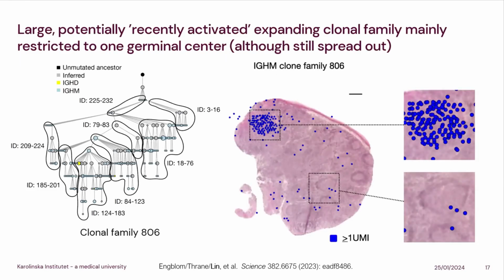Since we have 6 sections, we project all the spots from the 6 sections into 1. So we will find some spots that look like they are outside the tissue, but they are actually from other sides. They are still within the tissue, but we are merging them together. Most of the spots are located inside the dominant follicle, follicle 1, the biggest one.